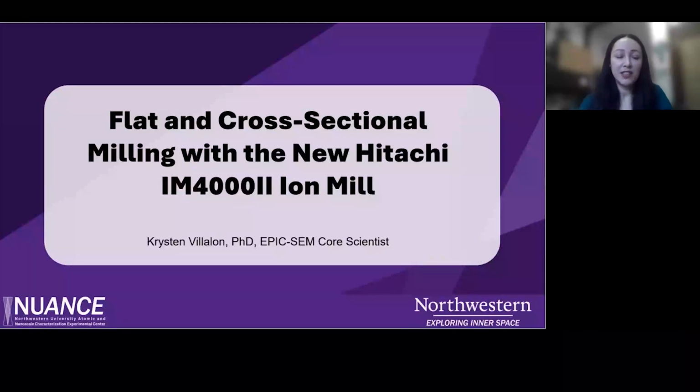A quick little talk just to introduce you to this new piece of equipment we got. Hopefully give you an idea of what it can do and why you might be interested in using it and if it might be a benefit to your experiments.